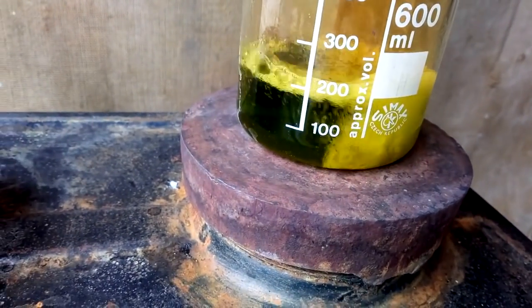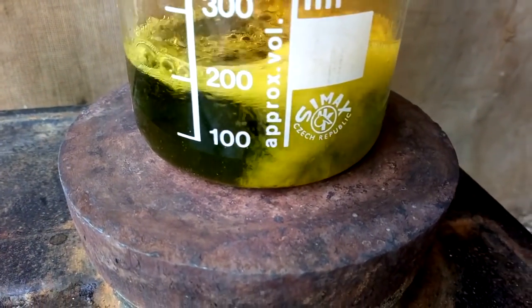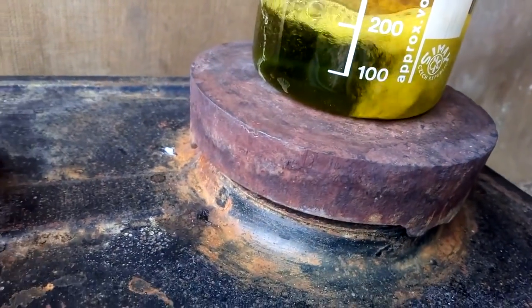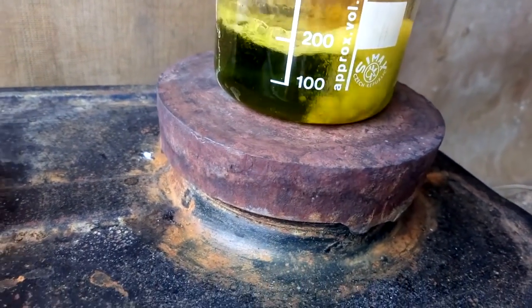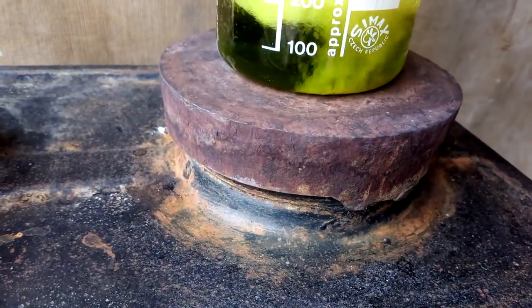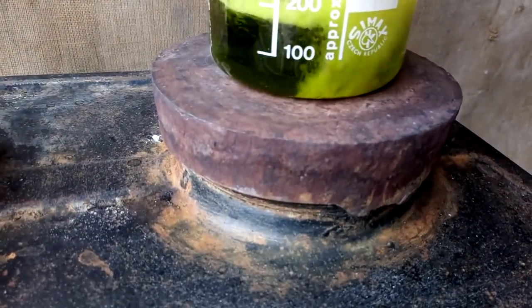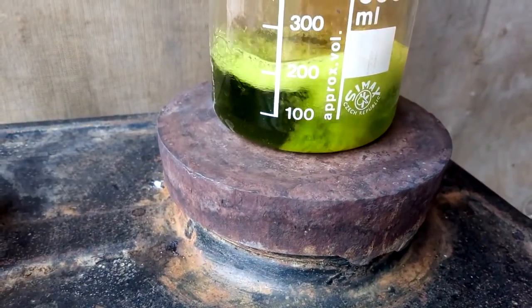Okay, after 10 minutes — see that — still got metal. But solution is dark green color. So that copper goes into the solution. I'm going to leave that for some more time.